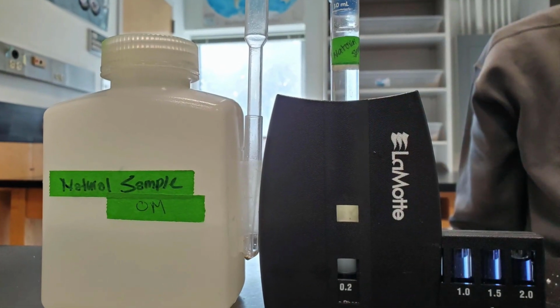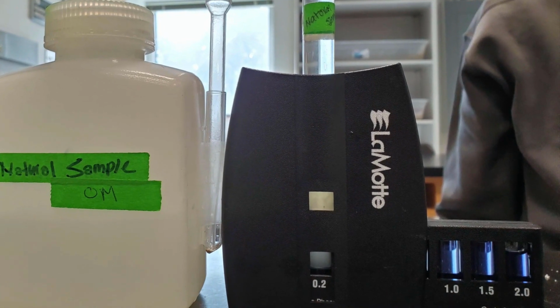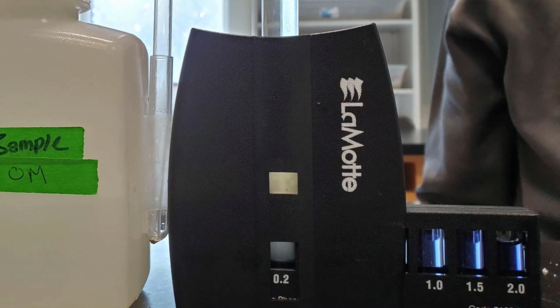This last measurement is labeled natural sample. Make sure that you write it in part 10, which has a separate chart.